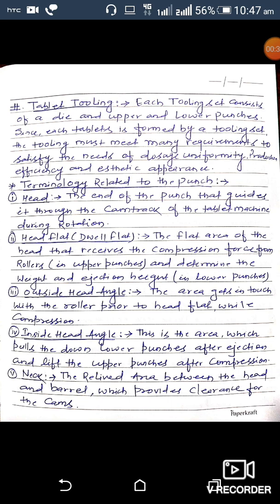First, the head — applicable to either upper or lower punch. The head is the end of the punch that guides it through the cam track of the tablet machine during rotation. Second is head flat, also called dwell flat. The flat area of the head that receives the compression force from the roller and determines the weight and ejection height is called the head flat of the punch.